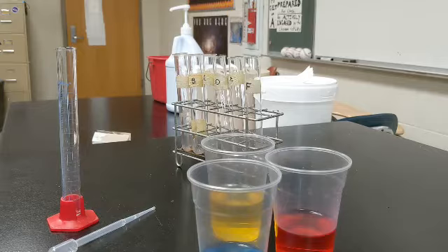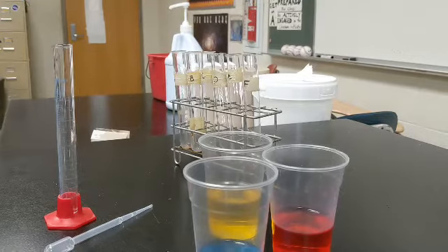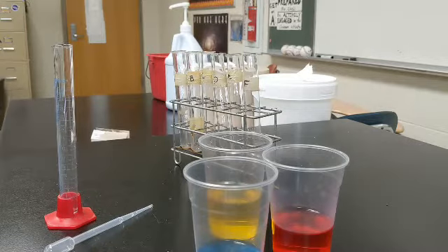But the main point was, I'm just going to read the procedure, and I'm going to do what the procedure says to do. You can pause the video and refer back to your lab sheet to read the procedure that I'm doing, okay? So for now, let's begin. Step 1, it says, into test tube A, add 19 milliliters of red water. All right, so let's do that.